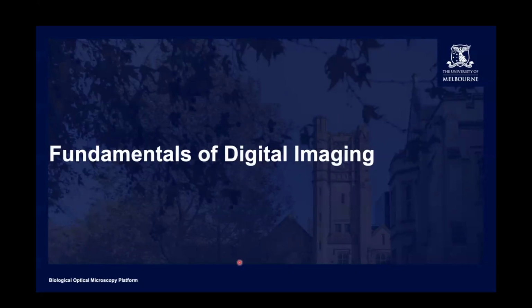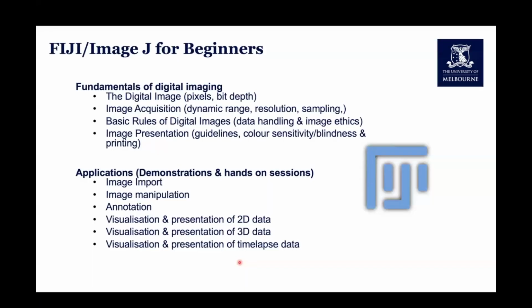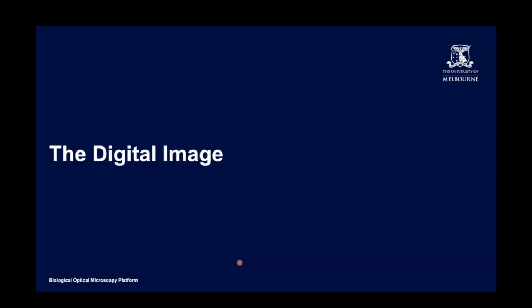Welcome to the Fundamentals of Digital Imaging lecture. This is the introductory lecture of the FIJI for Beginners workshop. In this lecture, we will cover the digital image, some image acquisition tips, basic rules of digital images, and image presentation guidelines. This will be followed in the workshop by some hands-on applications on how to import, manipulate, annotate, and present microscopy data. So let's get started with the digital image.